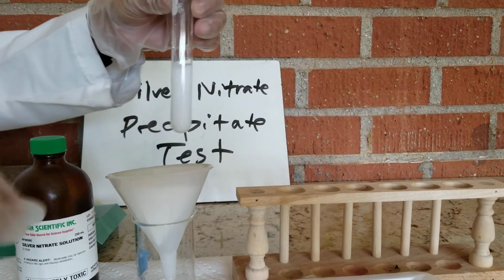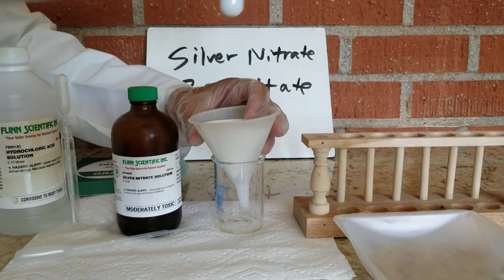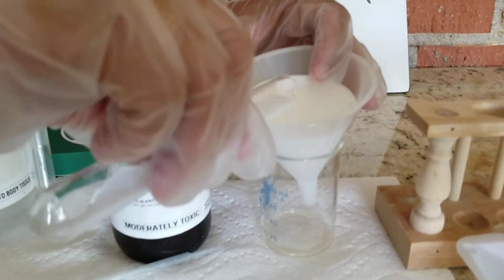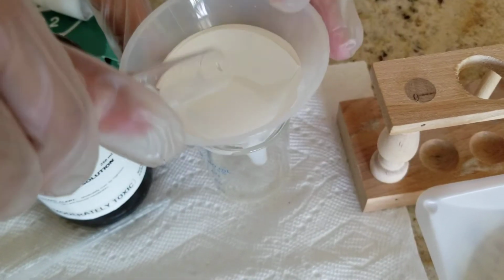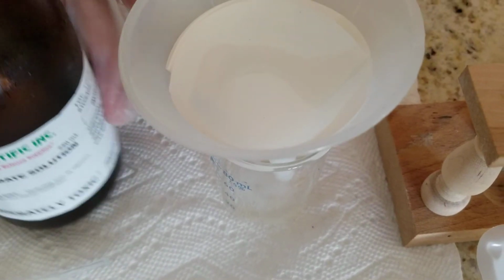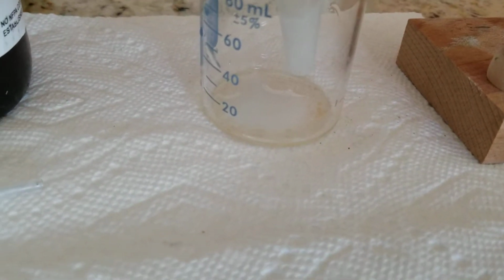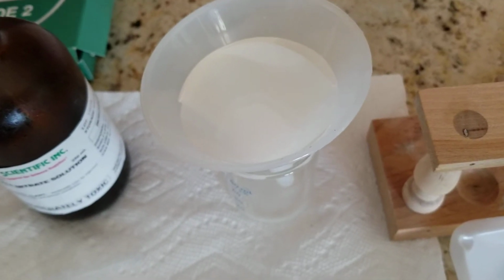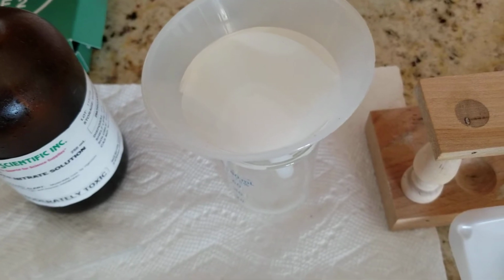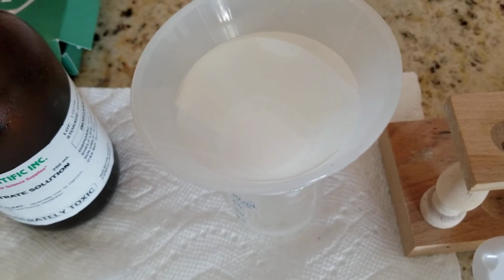And what I'm going to do now is use our filter paper. I've created it as a conical shape so it fits perfectly in our funnel. And I'm going to swirl a little bit and start filtering. Let's give it some time. Much of the liquid is getting absorbed by the filter paper. Our main goal really is to just make sure we don't have the solution itself as a big puddle in that filter paper. And then what we'll do is, if enough of the filtrate runs through, we'll open up our filter paper, take it outside, and then expose it to sunlight.